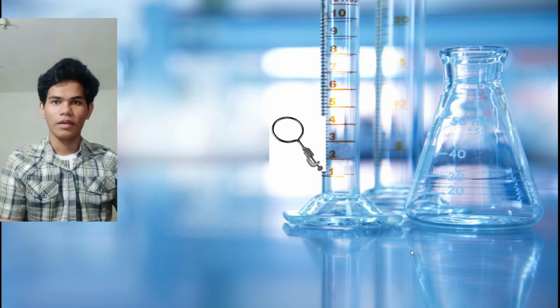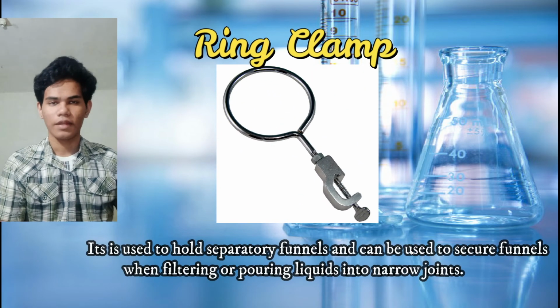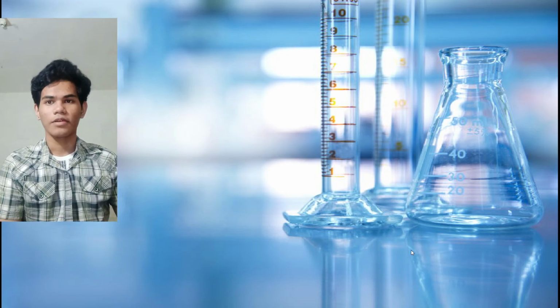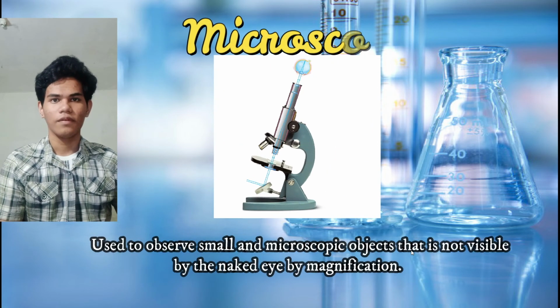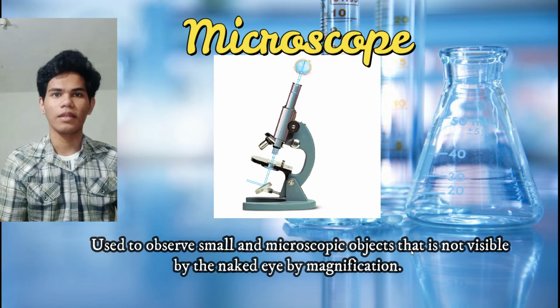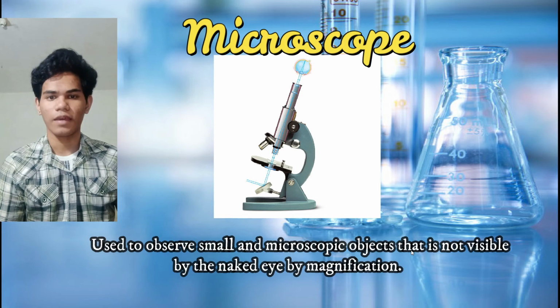Ring clamp. It is used to hold separatory funnels and can be used to secure funnels when filtering or pouring liquids into narrow joints. Microscope. Used to observe small and microscopic objects that are not visible to the naked eye by magnification.